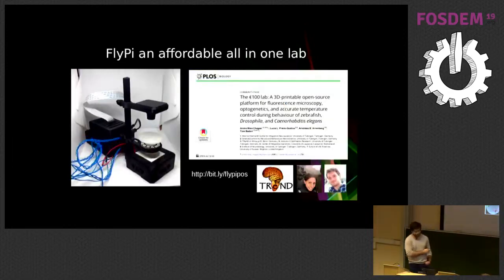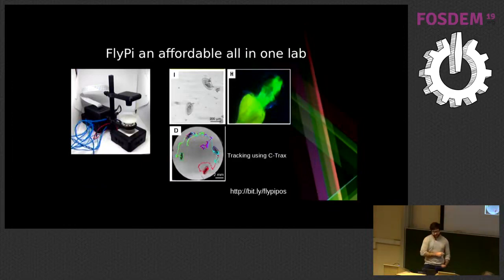I'm going to show that everything of this is on GitHub. And you can easily customize it. This doesn't have a scale, but it fits on the palm of your hand, and you can power it with batteries, so you can take it anywhere. We're going to see a little bit more details in a bit. You can also do videos with it.